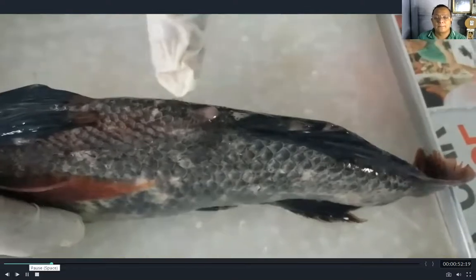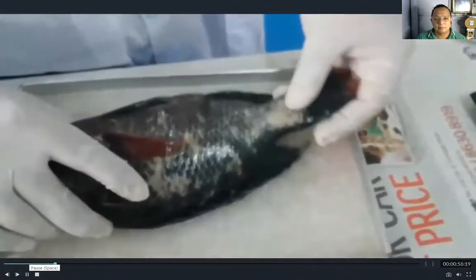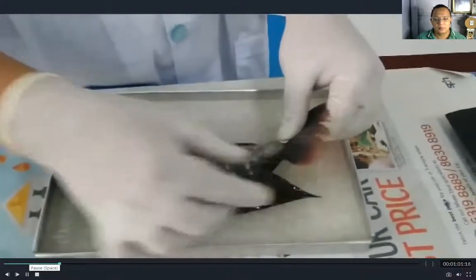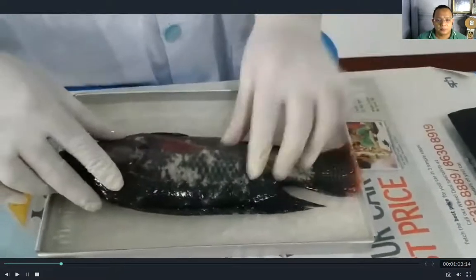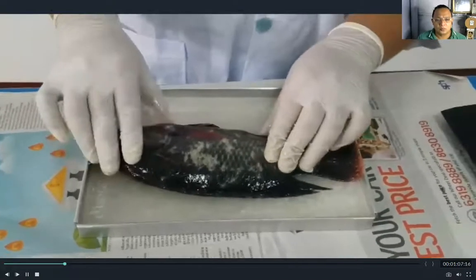Can you see the hole? That is the anus. And then the last one, we have the caudal fin. Now let us proceed with the internal parts of the fish.